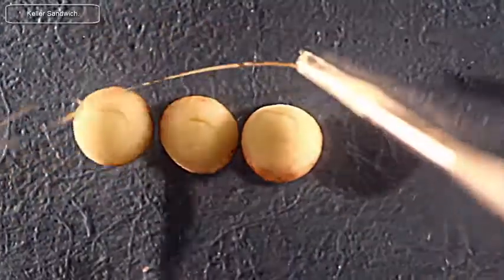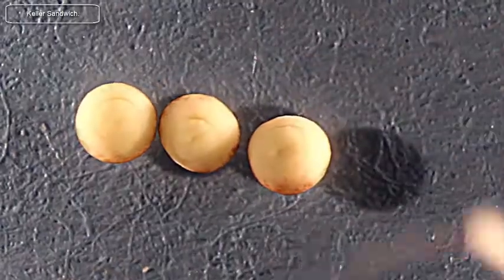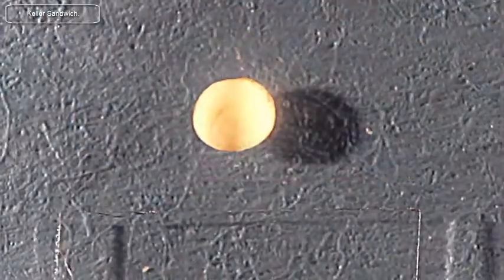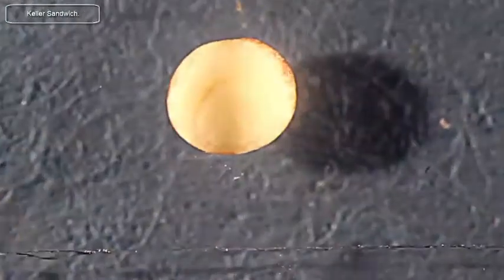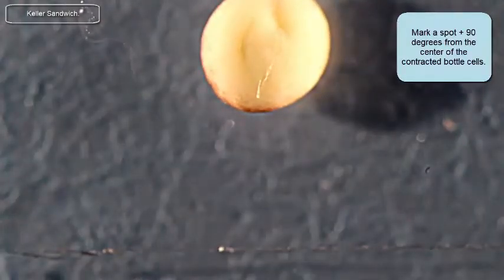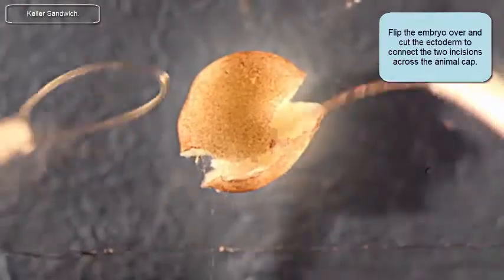Here I'm sorting out my embryos, looking for the ones that I want to make the sandwich with. I'll choose this one as my first dorsal marginal zone explant and start working on it. I want to make my first cut at about 90 degrees from the bottle cells — the midline indicated by the bottle cells. Make that first cut, make that second cut at the other side, and cut across the animal cap.